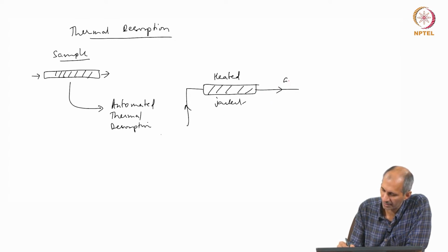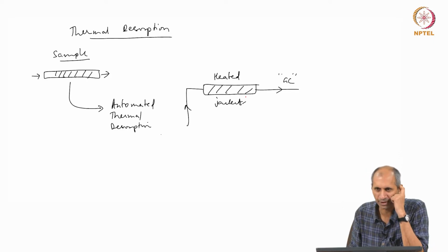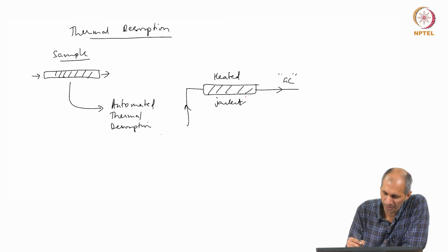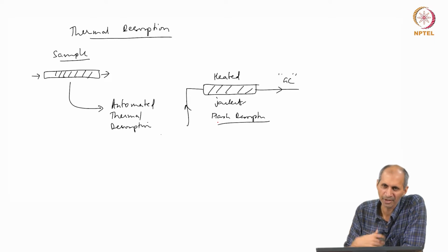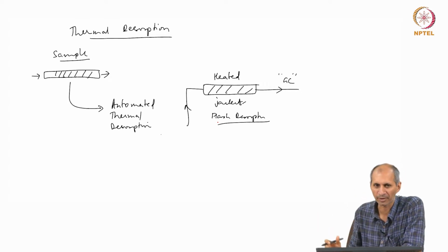So, let us say it needs to go to a GC, for example. When you heat this tube to a very high temperature, it will all come out, the desorption will happen, but it cannot stay there, it has to be taken out quickly. So, what we do is flash desorption. Flash desorption means it happens very quickly, the temperature just shoots up very fast, and everything comes off in one shot. If you do a slow temperature increase, it will come little by little, but you want all of it to come at once.